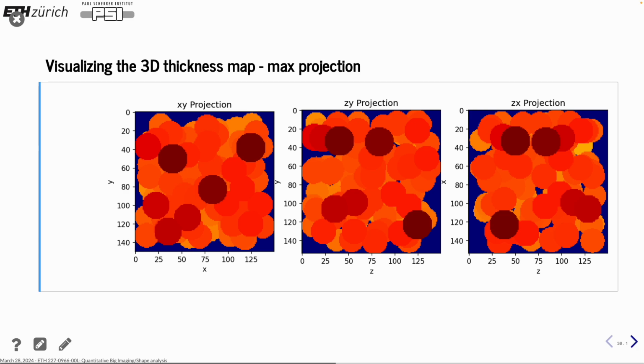And it tells us that somewhere in the data we have some very thick bubbles, but mostly they are about the same. And again, same view as different views. You can see also that there are some hotspots which are larger, but the rest is about the same. And maybe towards the edge, it's also tapering off a bit. So this is an alternative way.